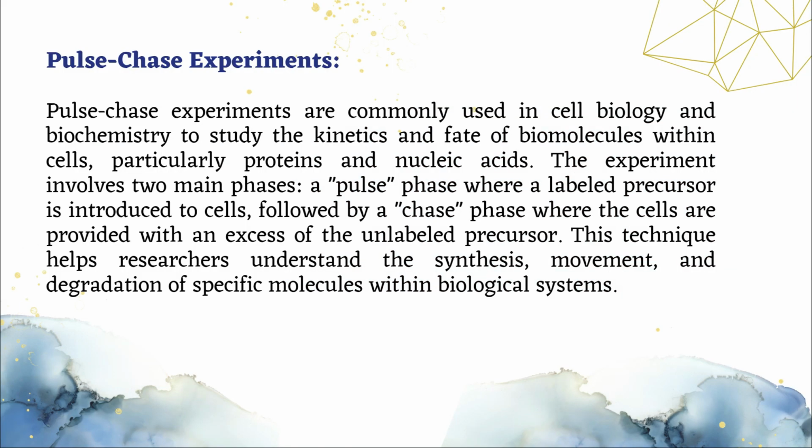Pulse chase experiment. It is the experiment which is commonly practiced or applied in cell biology and biochemistry in order to study the kinetics and fate of biological compounds or biomolecules within a particular cell or particular tissue. For example, proteins and nucleic acids: how they perform, what their shelf life is, how they are influenced by exposure to various other environmental stress, etc.